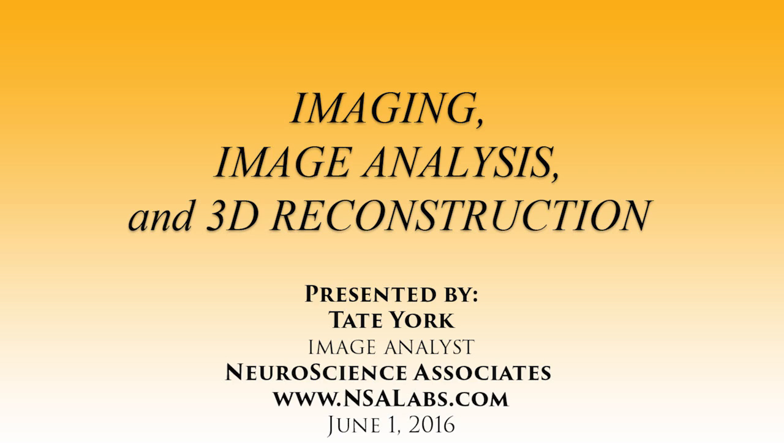So this is the equipment that we have in-house. I'm not going to bore you guys with all of the technical terms here. We have 3 Nikon scopes. One is fitted with a fluorescence module, and we have different filters showing a range from blue to red fluorescence, all equipped with digital cameras.